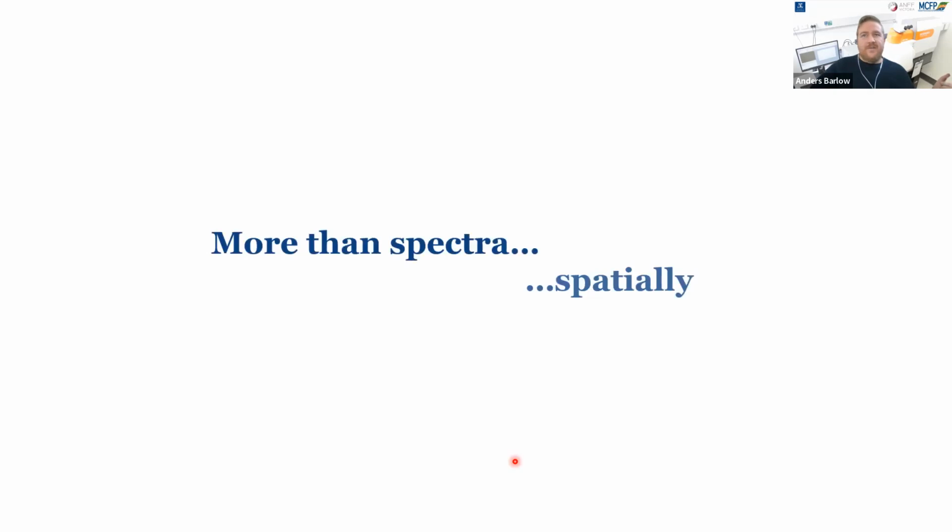So then this now brings us to the next part of the talk, the next two sections of this particular webinar, where I would prompt you to think more than spectra, basically. And the first part we're going to think about when it comes to spectra now, or the different types of data we can collect, is to think spatially, as in not just basically going to a position on your sample and collecting the spectrum and then moving around and doing that, but actually trying to build into your experiments some interesting spatial experiments as well.